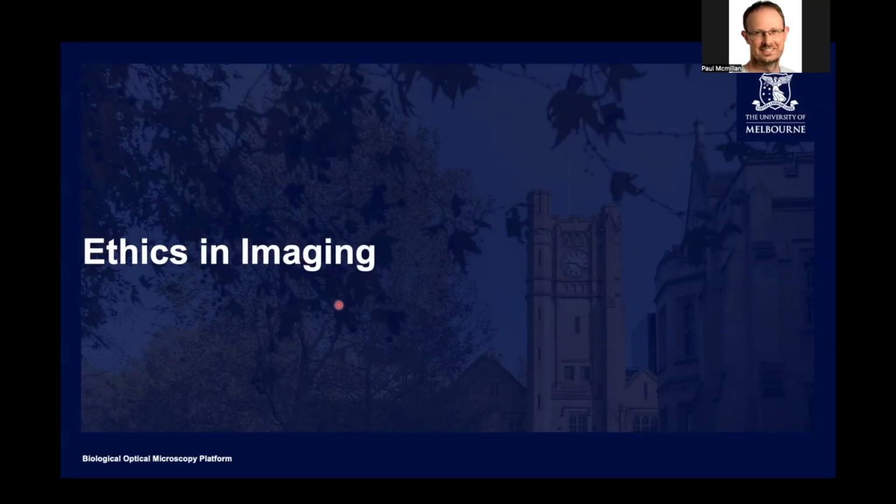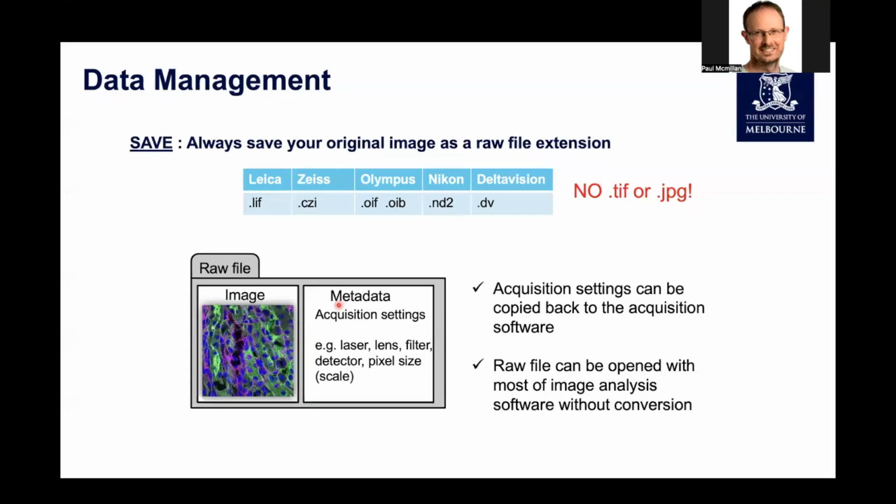All right, so the last section that we're going to go through is ethics in imaging. Once you have generated your data, what should you be doing with it? The first thing I want to talk a little bit about is data management and how you should be handling that data once you've acquired it on the microscopes.